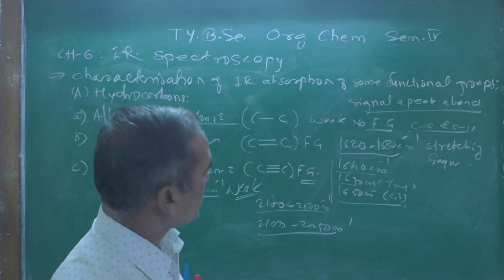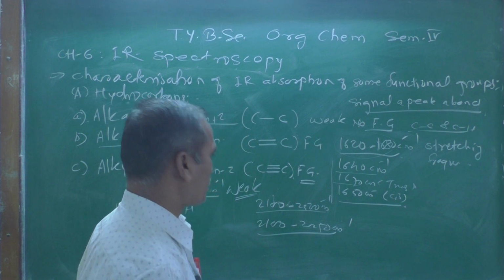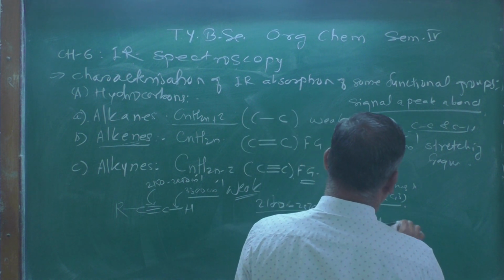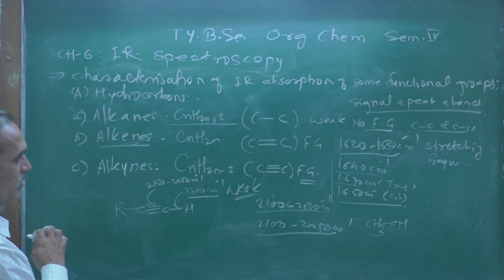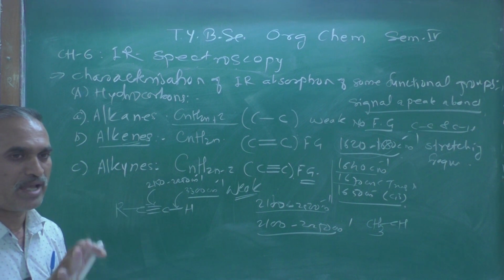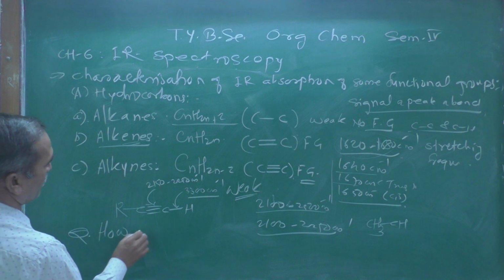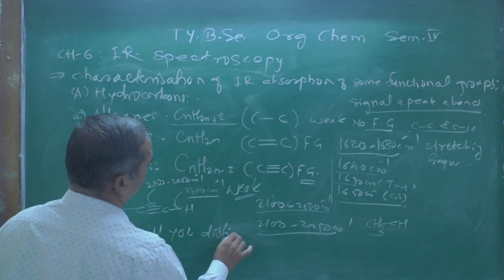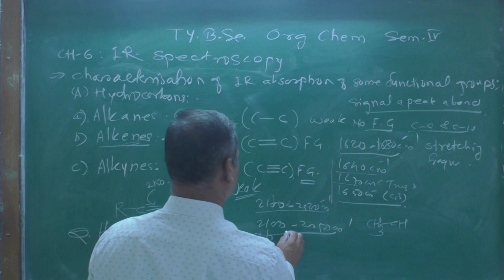Let us see one of the compounds over here. Suppose a question may appear in the exam: how will you distinguish the following pair by IR spectroscopy?